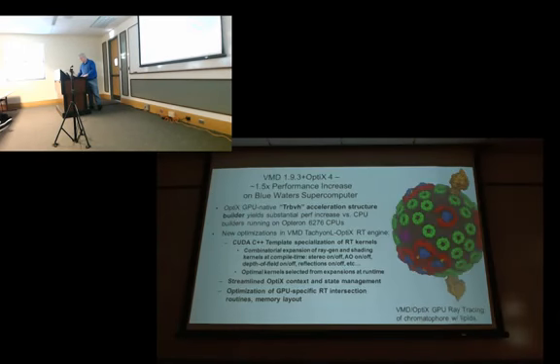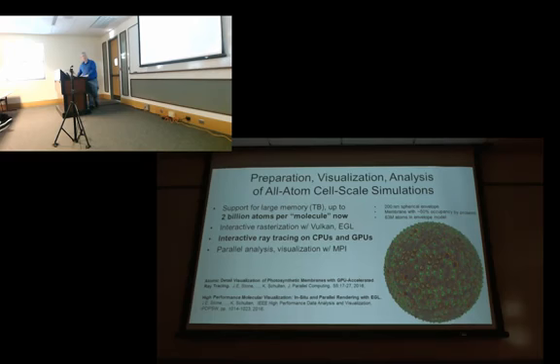Let's see, I'll skip through some of these. Going forward, we put a lot of work into expanding VMD to support larger structures. As of the most recent version, you can load up to 2 billion atoms in a single molecule. I don't recommend trying to interactively draw it with OpenGL. This is where OpenGL has trouble, but the ray tracer has no problem at all. So this is an interesting area because it's at the crux of where ray tracing becomes more interesting as an alternative, even for regular interactive display.